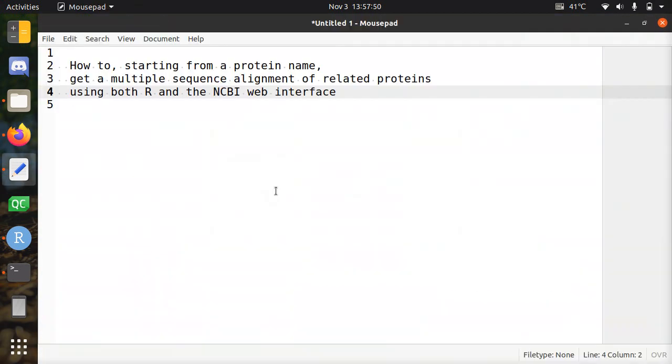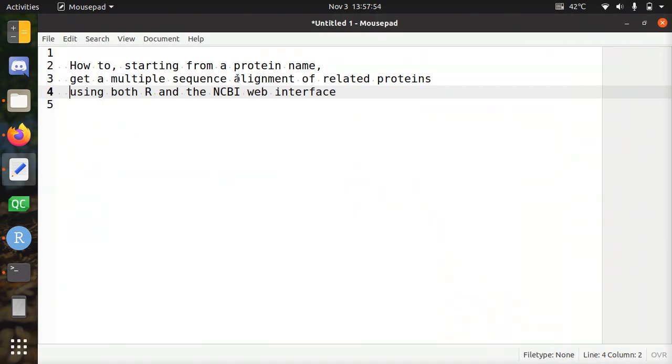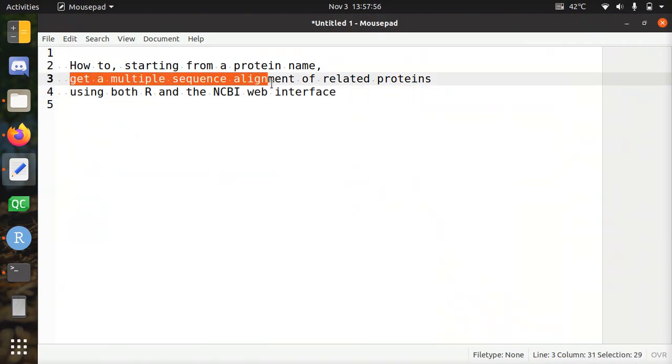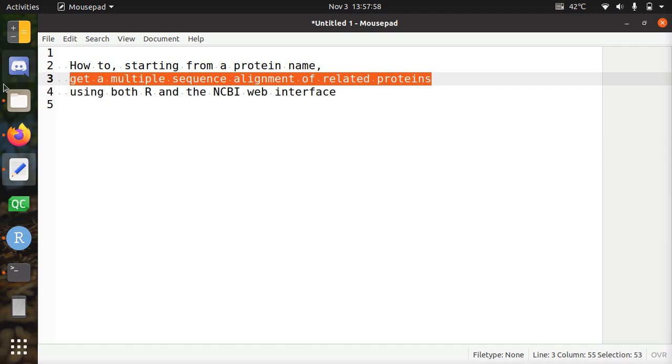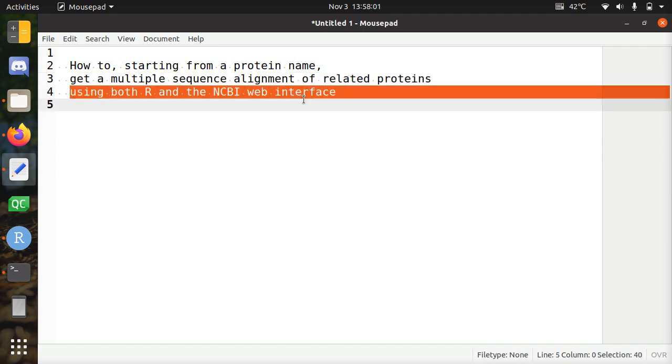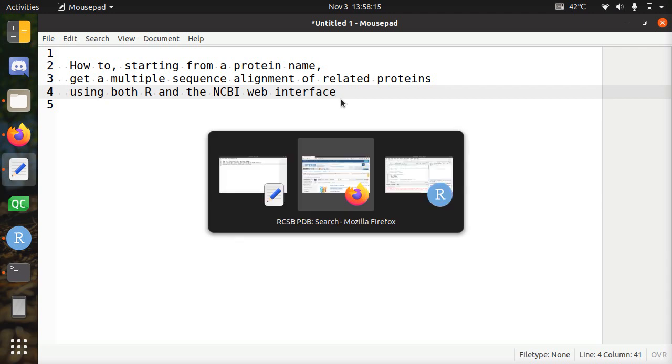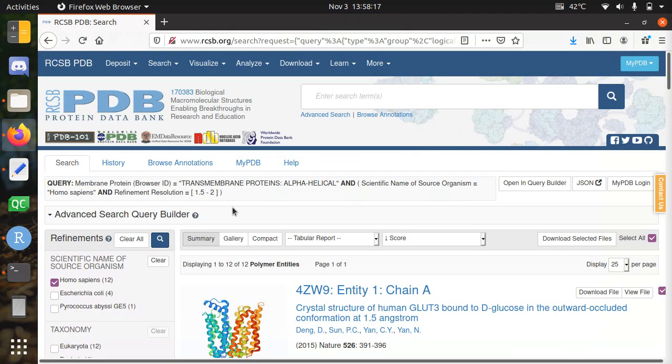Hi, I would like to show you how to, starting from a protein name, get a multiple sequence alignment of related proteins, including that one, using both R and the NCBI web interface. There's one long waiting step in this, so first I'll go through it fast and then I'll track back, especially because to get the related proteins will take long. Alright, so I'll just start it working.